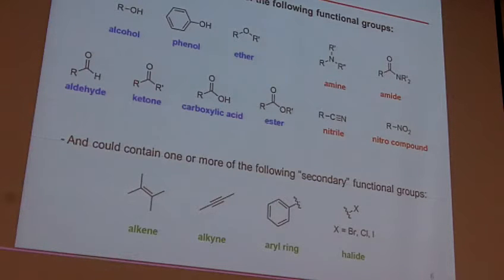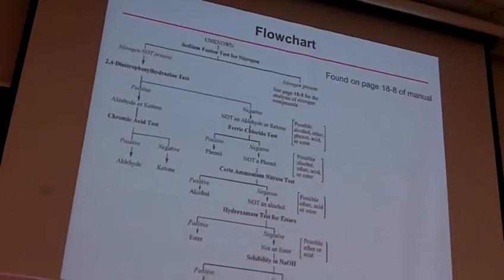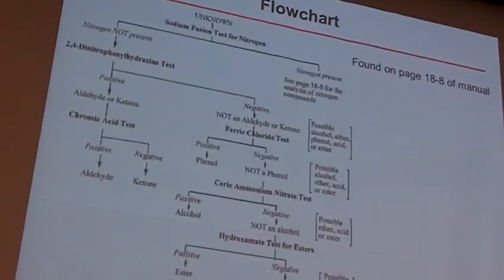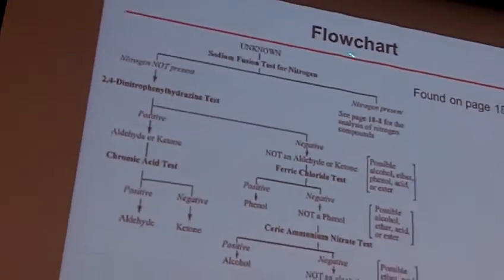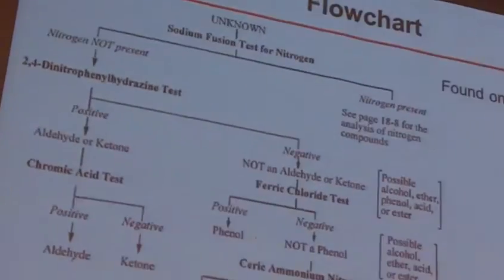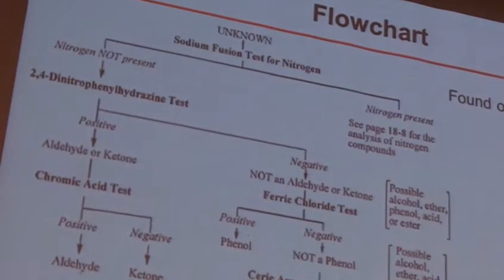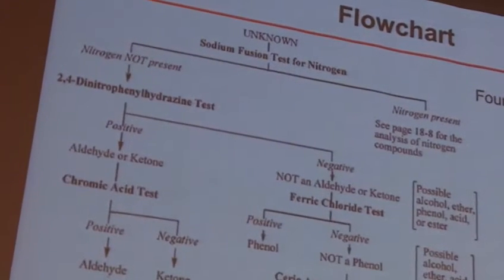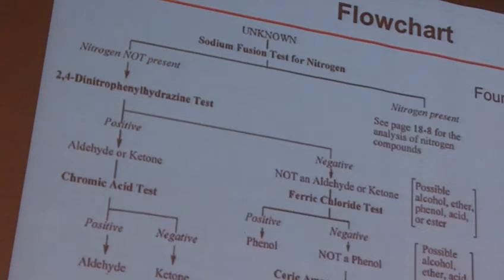All right. Where do you start? You're going to have a flow chart. If you look on page 18.8 in your manual, if you want to pull it out and follow along, it could be useful. Otherwise, it's there. You have a flow chart that looks like this. This is going to be the process. Start at the top, work your way down, and figure out where you go. What this is going to do is guide your functional group examination, and then ultimately let you know which of those primary functional groups, those two that I showed up on the top, you have.